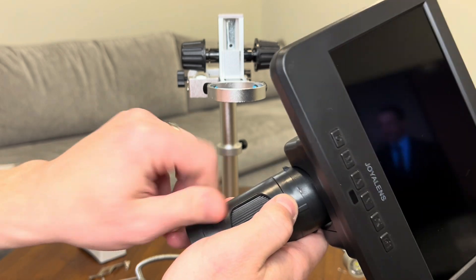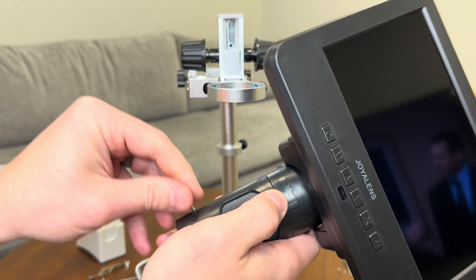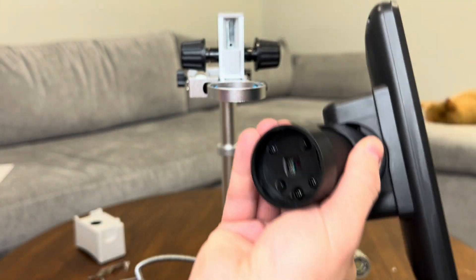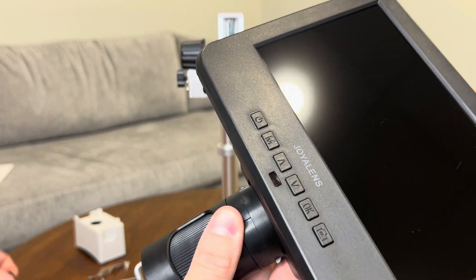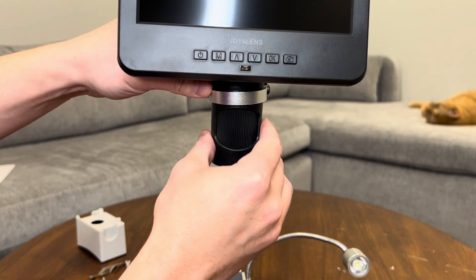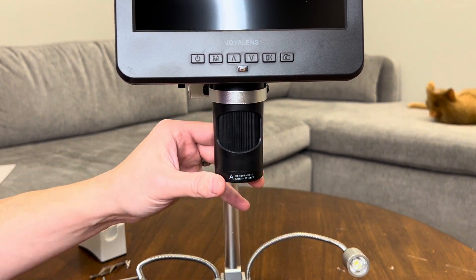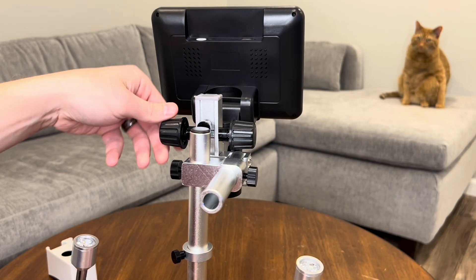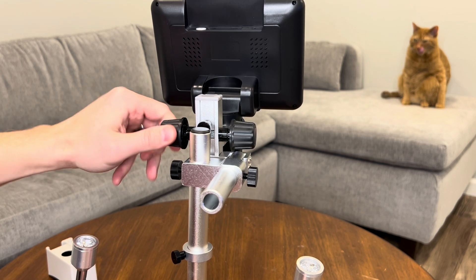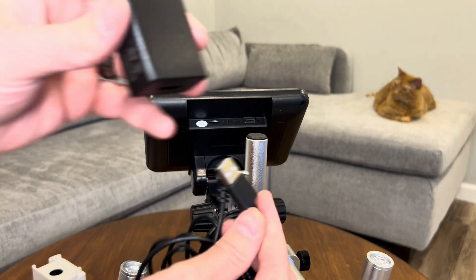To attach it to the stand, you have to remove whatever lens you have on it first. The lens is secured with just two small screws on both sides. Once the screws are removed, you slide the lens right out. Now with the lens off, you can mount the microscope to the stand and then reinstall the lens. As you can see, the adjustable stand is really easy to move around, and it stays securely in place once you've adjusted it.